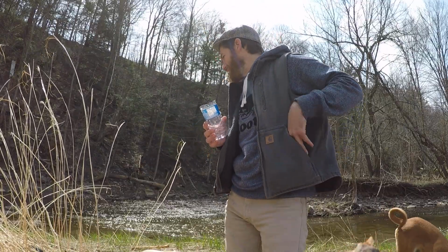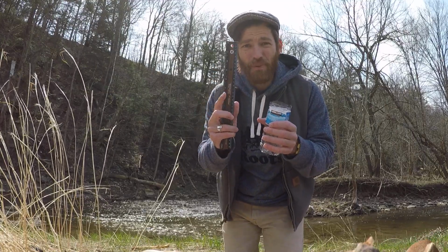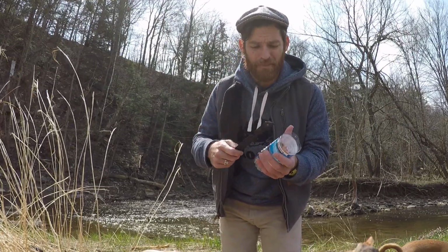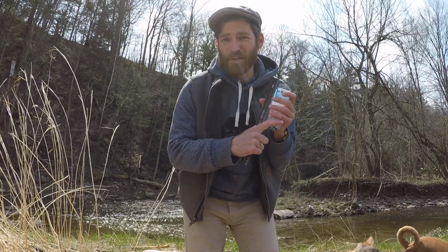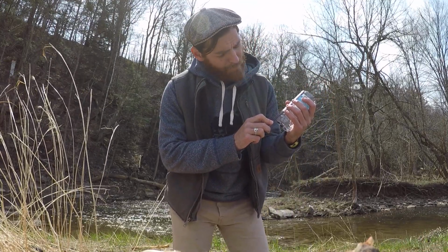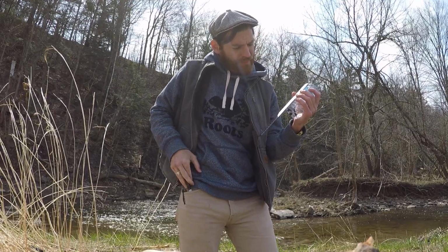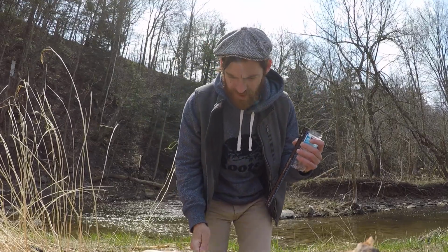Okay, and then the next thing you're going to do is take this measuring tape like you had before when you were doing your Wolman pebble count, and put measurements on the side. So I've got about 14 centimeters. So here, I'll do little lines for 14 centimeters.